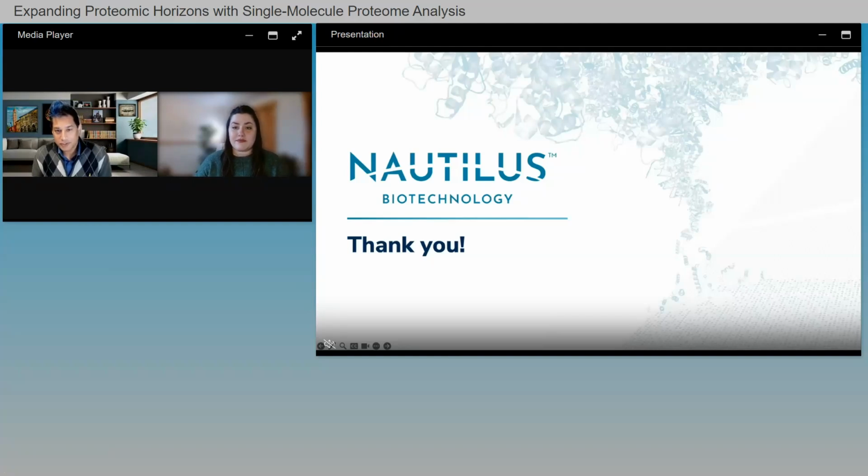Thanks so much for the question, and thanks everyone for joining us. The answer is yes. The platform is incredibly general. And so we've done a lot of work specifically on tau, but we've also looked at other proteins, including targets like P53 and EGFR. And so really the constraint on the targeted proteoform analysis is really just about what affinity reagents are available.